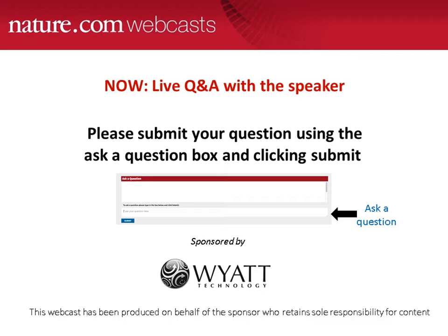But I'm not using the newest generation light scattering detector. The newest light scattering detectors that use the microcell, versus my regular flow cell, I think they can measure 10 times less protein than I can. But I cannot speak for this. I would refer it to Wyatt Technology support to ask this question directly, to get the estimate for the newest detectors.